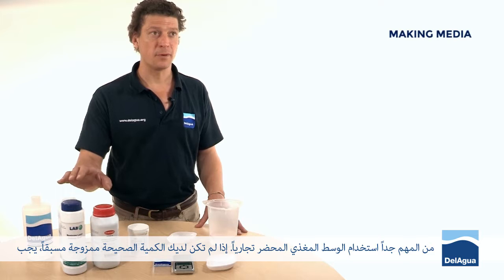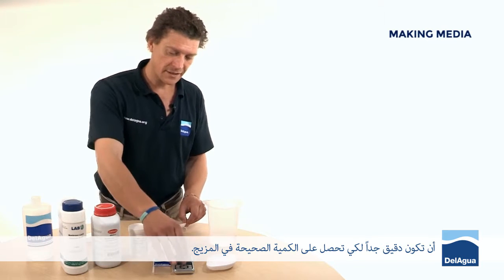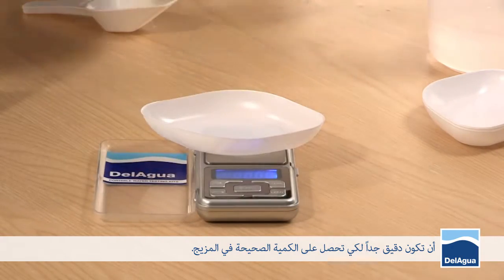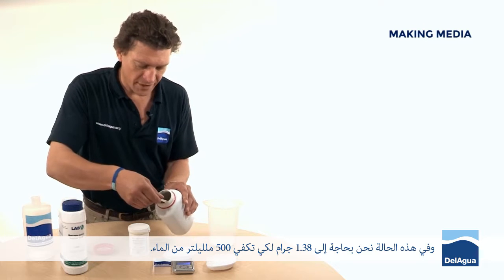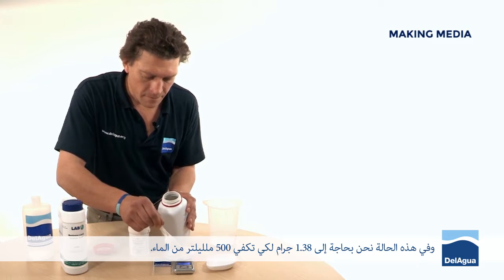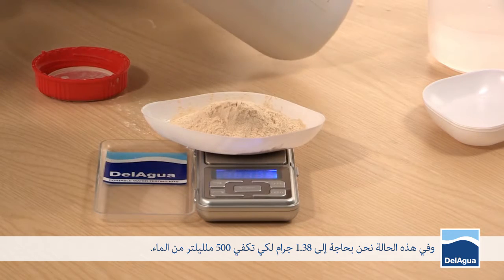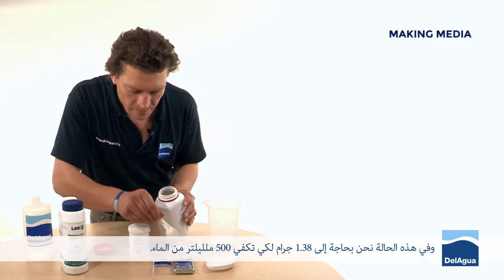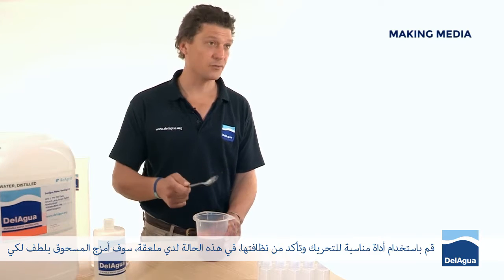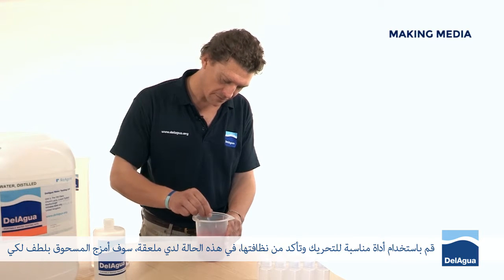It's important to use commercially prepared media. If you don't have access to the right volume already mixed, you need to be very accurate to get the right amount of powder into the mixture. In this case we need 38.1 grams exactly to go into 500 millilitres of water. Using a suitable stirring instrument that's clean — in this circumstance I've got a spoon — gently mix the powder until it's completely dissolved into the liquid.